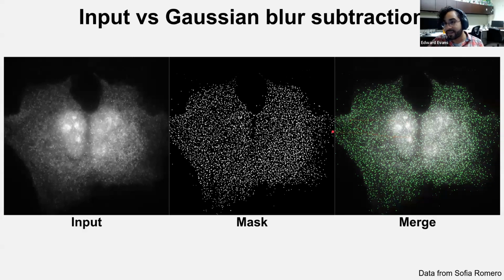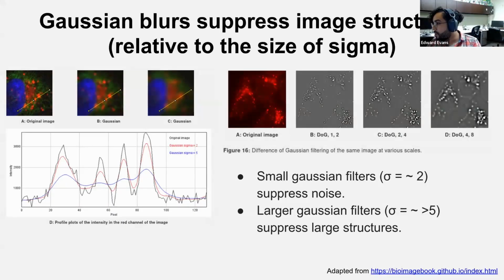And so now, right, I've made this mask. This is what would be segmented, right? So we can then use that mask like we did with the blobs to measure the shape of the puncta, the intensity, Feret's diameter, other kinds of shape descriptors or geometries of the puncta here. So how does this all work? What's going on? And then let's go look at it, okay?